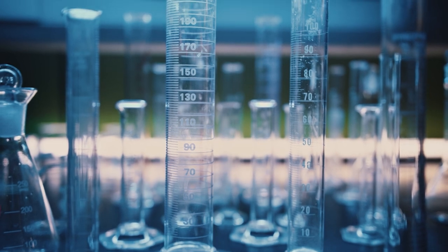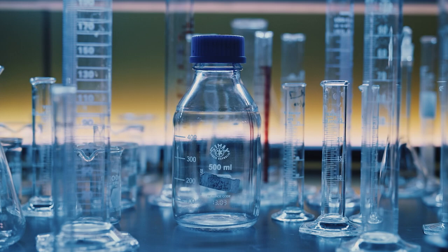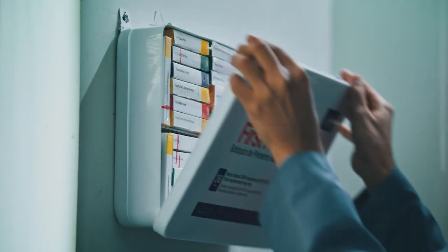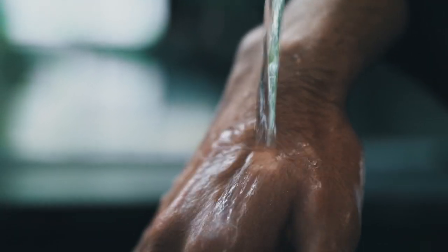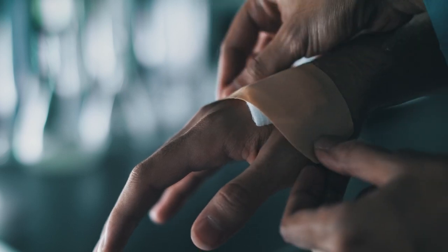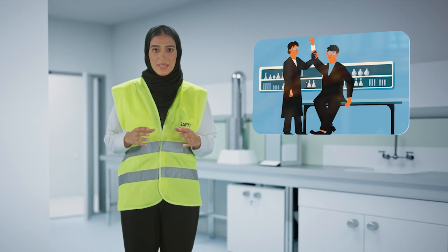Labs rely on glass pipettes, beakers, and other containers, and if they break, they can lead to cuts. If you are with someone who has a minor cut, these steps must be ensured. Apply pressure to the wound with sterile gauze. Wash with soap and water. Apply a sterile bandage. For a more serious cut, have the person sit down and raise the bleeding part while adding pressure. Continue to add pressure while transporting them to urgent care or emergency room. If the bleeding is severe or the person feels faint or lightheaded, call 999.